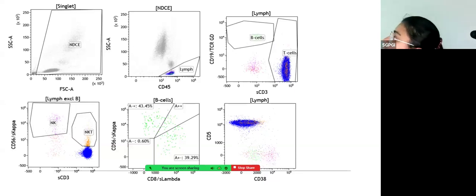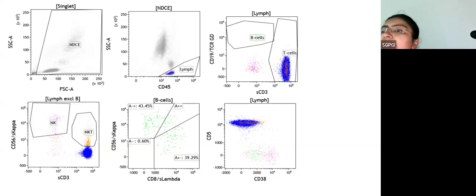You are supposed to have lymphocytes, monocytes, and neutrophils. In an adult male, which should be the most dominant cell? Neutrophils. So here, what does it appear like? Everything appears to be like a lymphocyte. Very, very few cells in the mono and the neutrophilic region. So the forward scatter versus side scatter plot tells you that there is an abnormality.